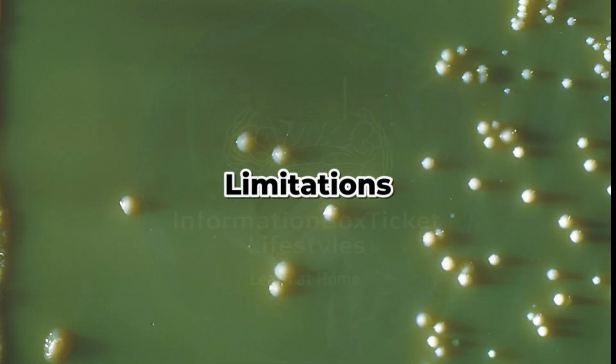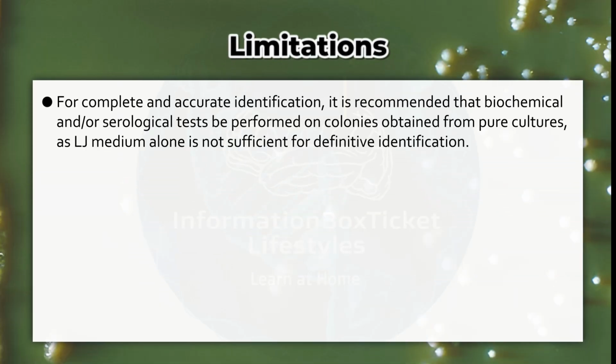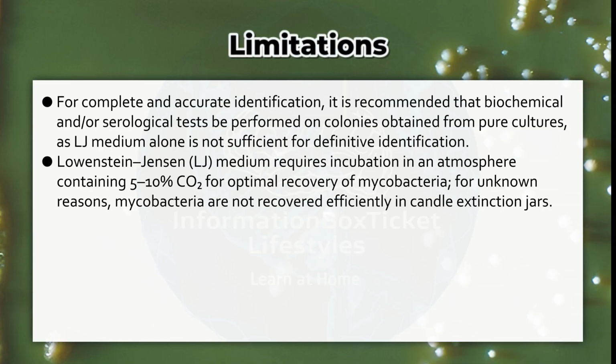Limitations of LJ medium. For complete and accurate identification, it is recommended that biochemical and/or serological tests be performed on colonies obtained from pure cultures, as LJ medium alone is not sufficient for definitive identification. Lowenstein-Jensen, LJ medium, requires incubation in an atmosphere containing 5 to 10% carbon dioxide for optimal recovery of mycobacteria. For unknown reasons, mycobacteria are not recovered efficiently in candle extinction jars.